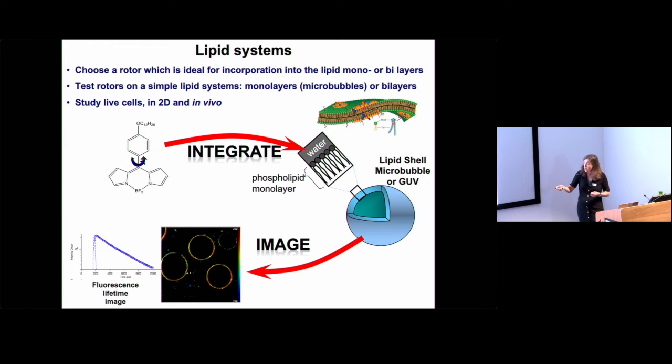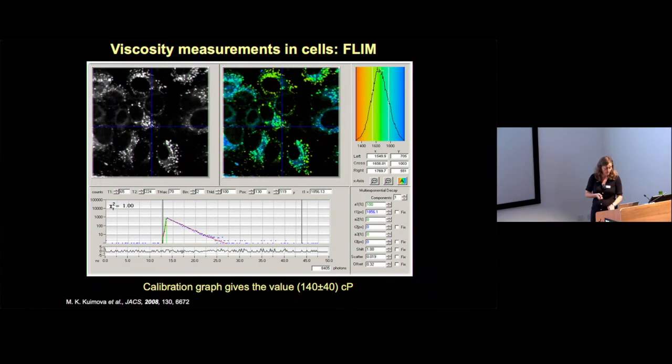And of course, FLIM, where the decay, let me just repeat, in every single point of this image is measured. And so as a result, the lifetime here, blue for shorter lifetimes and red for longer lifetimes, essentially visualizes different domains where the lipids are packed in a particular way. And that gives us the map of viscosity with good resolution.